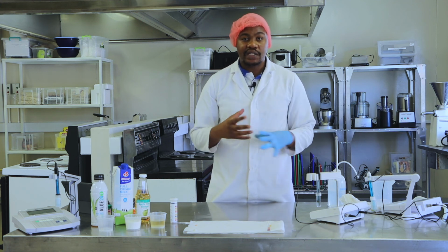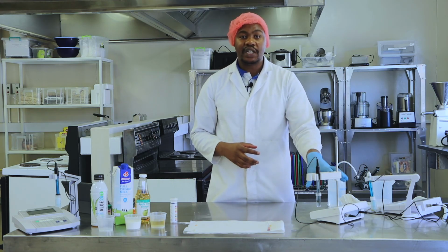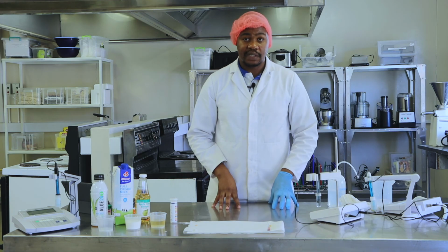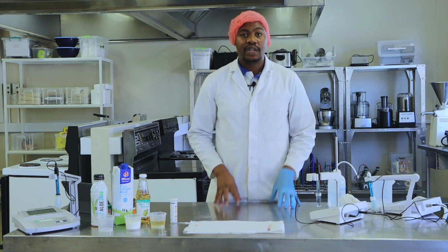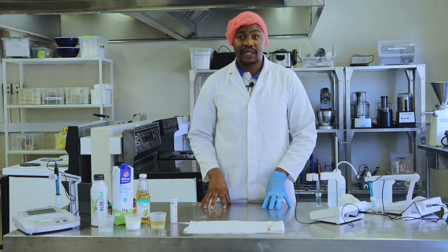So in the food industry, when we design food specifications, we rely on the pH meter tool in order for us to have a quantitative number that we can put in a product specification. So now you've seen how we can measure pH. Then the question is, how do we measure pH of solid materials or semi-solid materials?